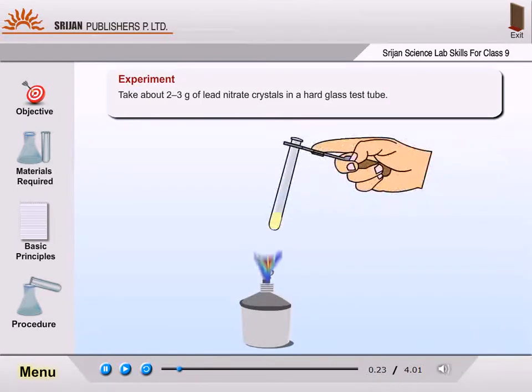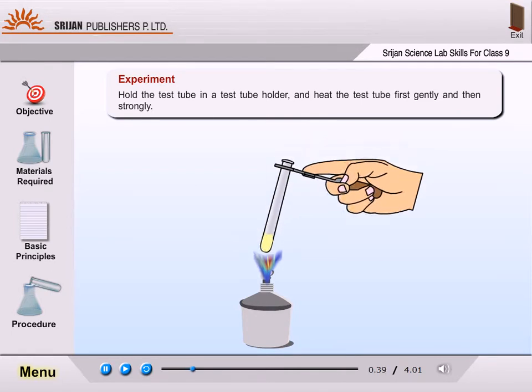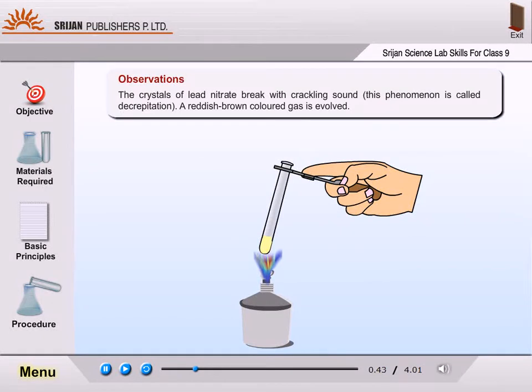Take about 2 to 3 grams of lead nitrate crystals in a hard glass test tube. Hold the test tube in a test tube holder and heat the test tube first gently and then strongly. The crystals of lead nitrate break with a crackling sound. This phenomenon is called decrepitation.